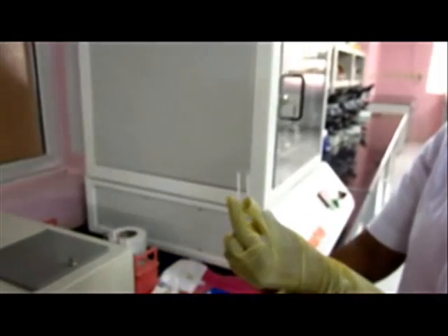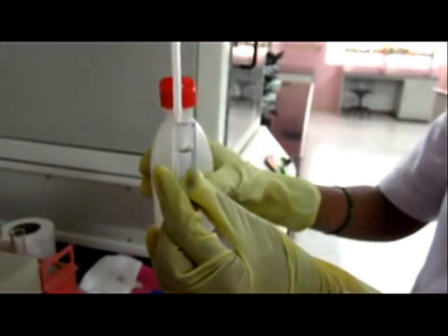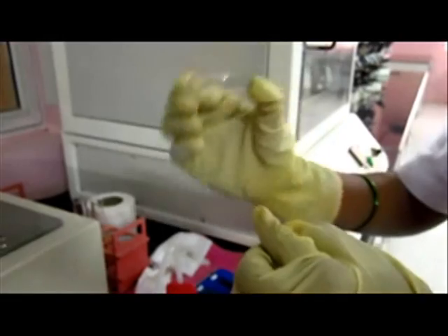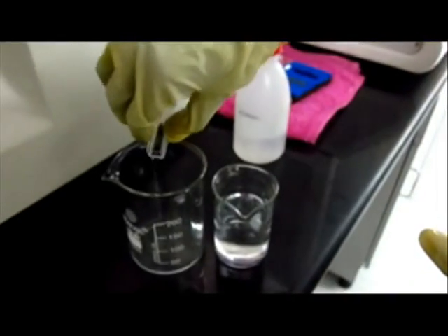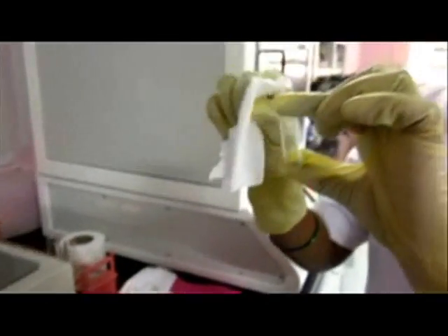Properly clean your cuvette with ethanol and distilled water. Always wipe the exposed surface of the cuvettes by using tissue paper prior to use. The cuvette should be dry and free from fingerprints.